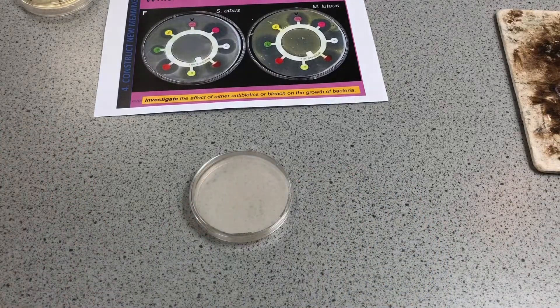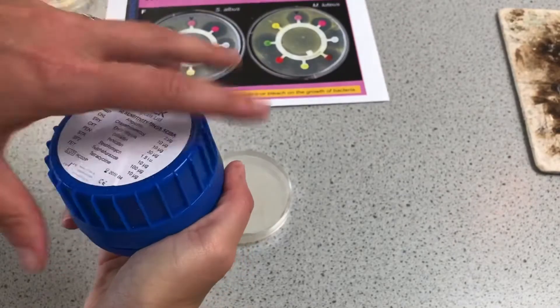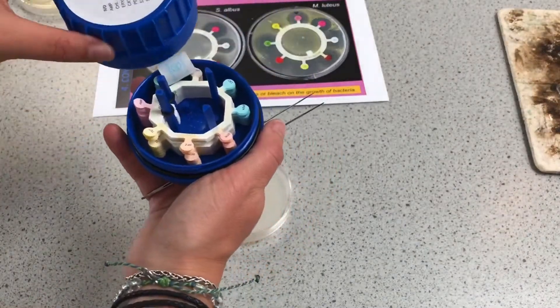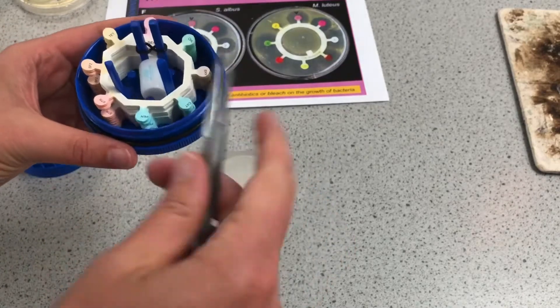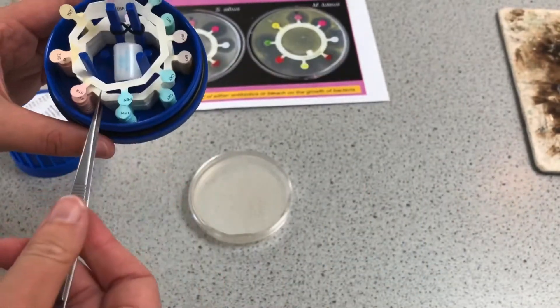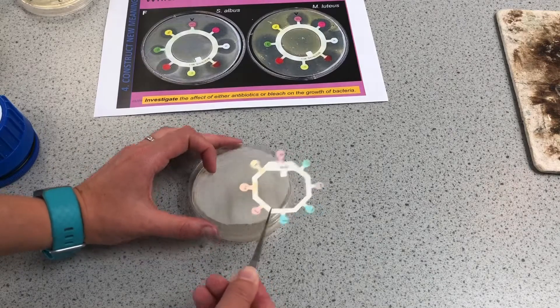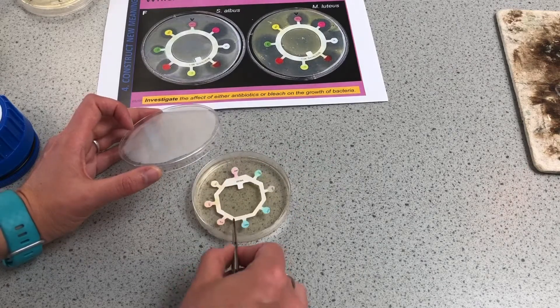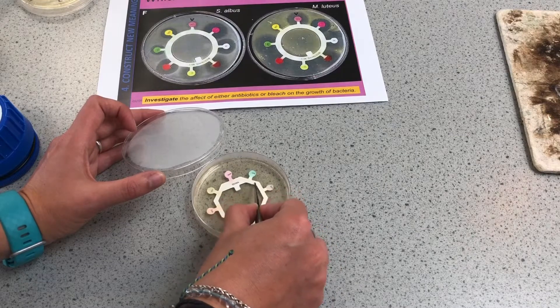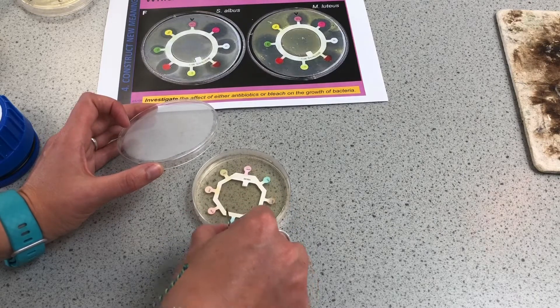I've got good coverage of the bacteria. I have my antibiotic discs kept in this container. I'm going to place this onto the E.coli and just push down on the different discs — there you go, they seem to be sticking down quite nicely.